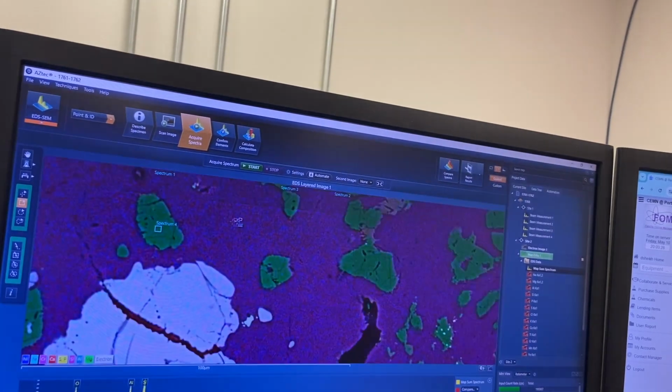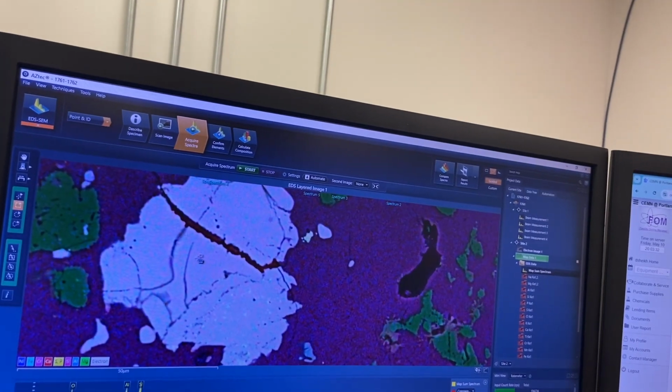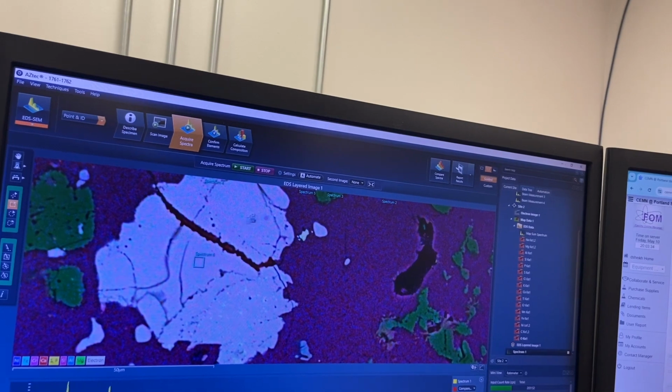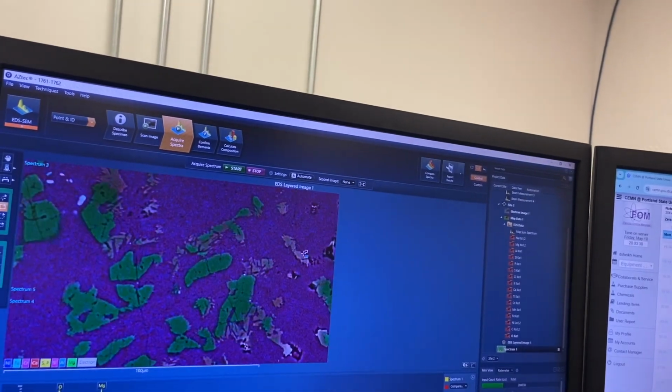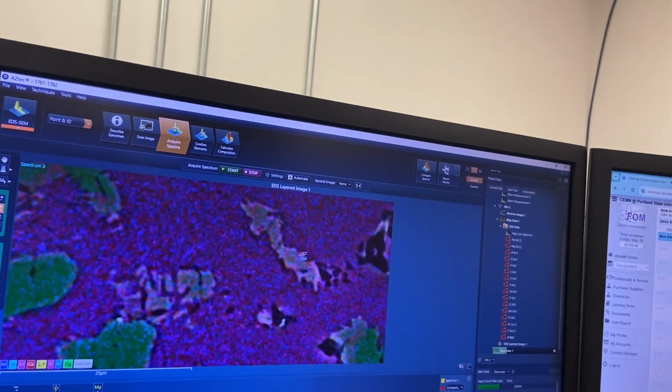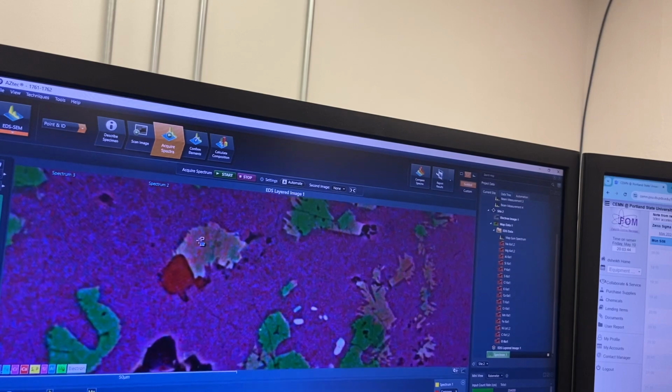So a couple of these olivines, another one of this. Looks like a sulfide there. This might be a chromite. I don't really want to get it, but sure, I'll just get one. Why not? And then let me get some of these pyroxenes real quick. This looks like it might be too small. All right, let's maybe do this area here.